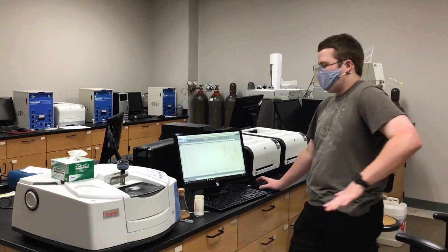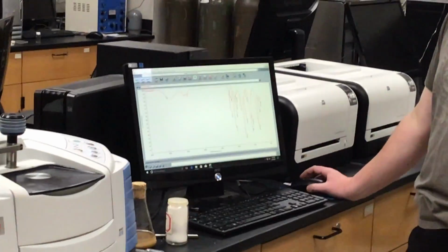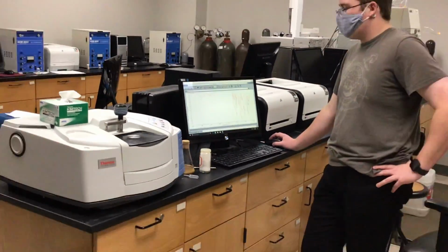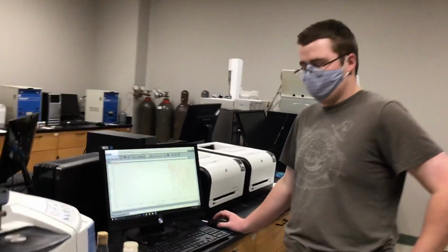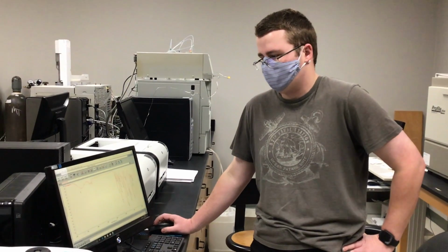Okay, so by request, I'm going to show you how you can save some of the IR spectra that you saved on this computer. You have two different ways that you could do this. It's kind of your choice which way you do it. It doesn't really matter that much so long as you get a pretty decent picture of whatever you're looking at.